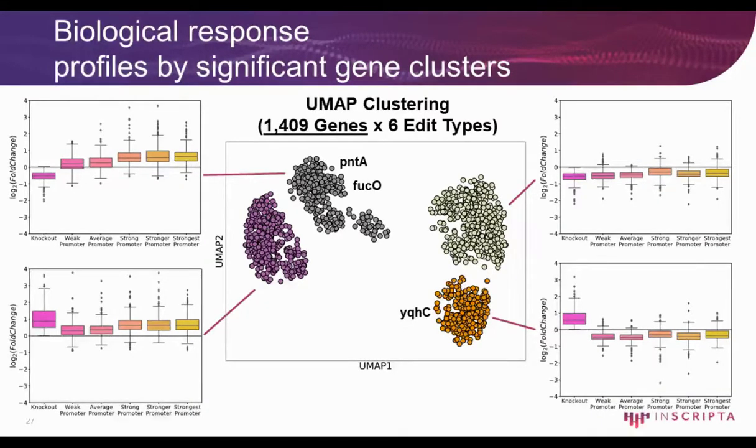In the other end of the spectrum, we also see the knockout of specific genes seems to bring a growth advantage to the cells when under Furfural toxic stress. And adding a promoter in front of those genes do not do any good for the cell survival in the population. Sometimes biology makes sense, and sometimes you get surprised about which gene behave like this. So in this cluster of genes, we find functions of carbohydrate metabolic processes and NADPH dehydrogenase activity.